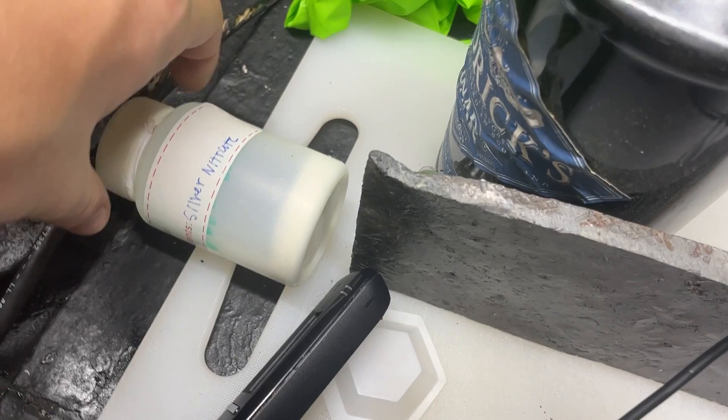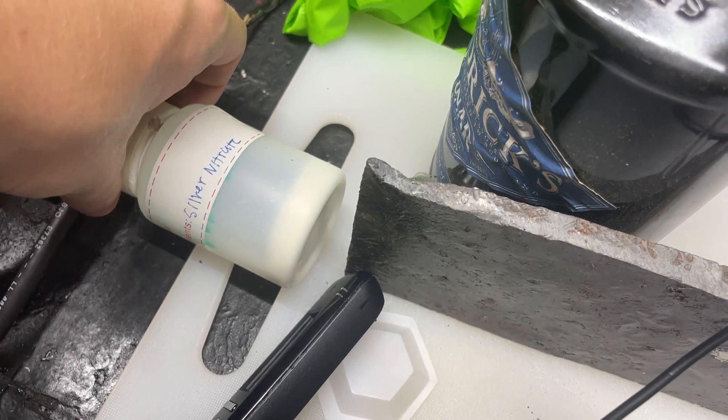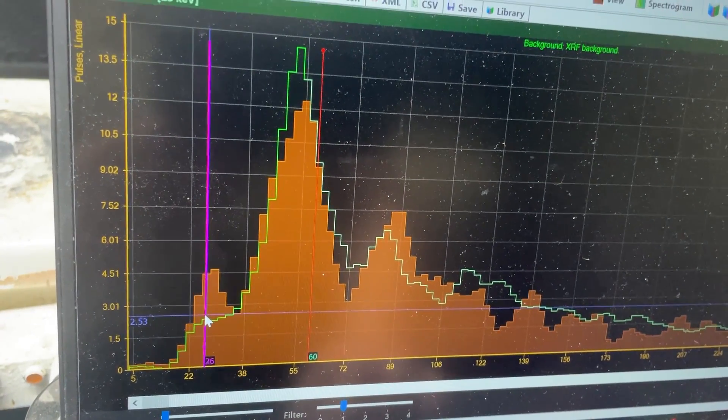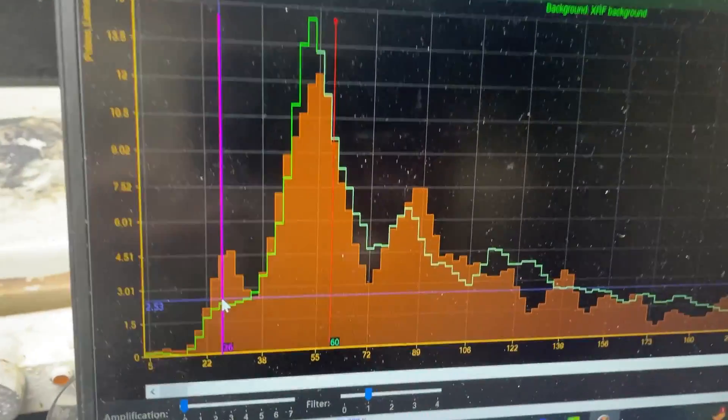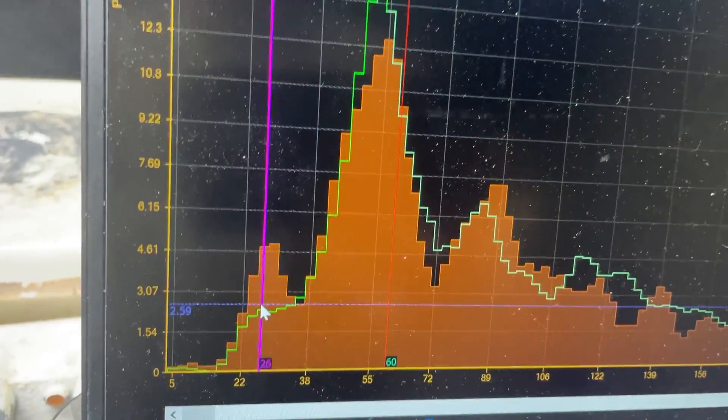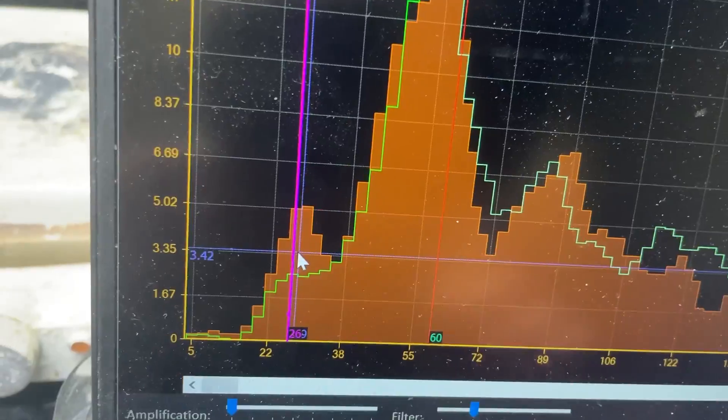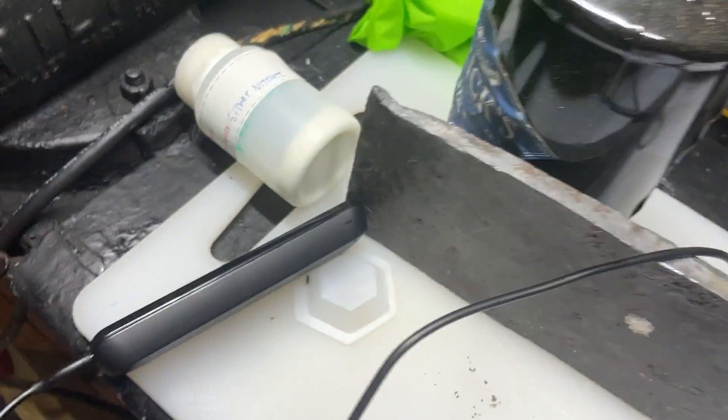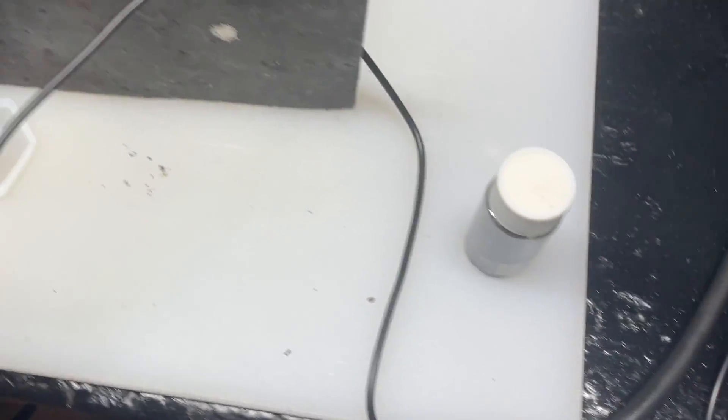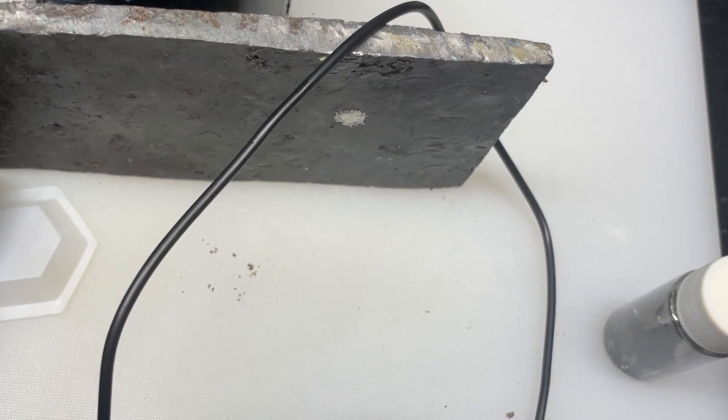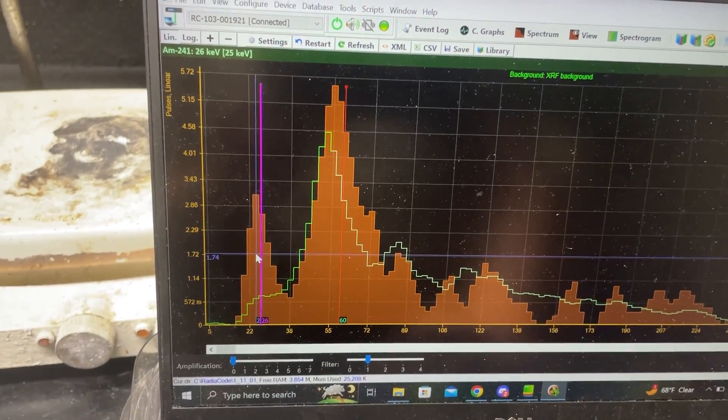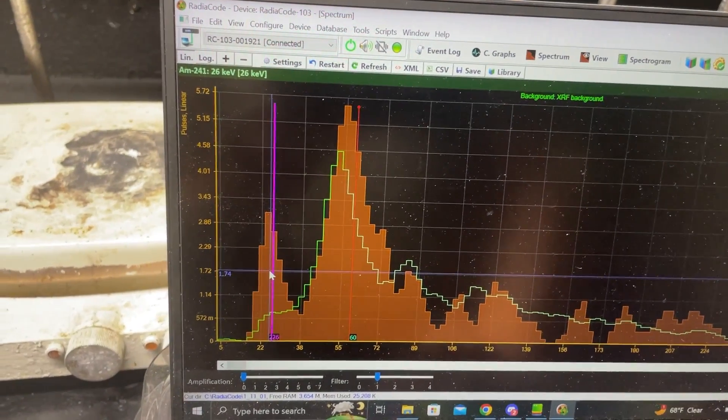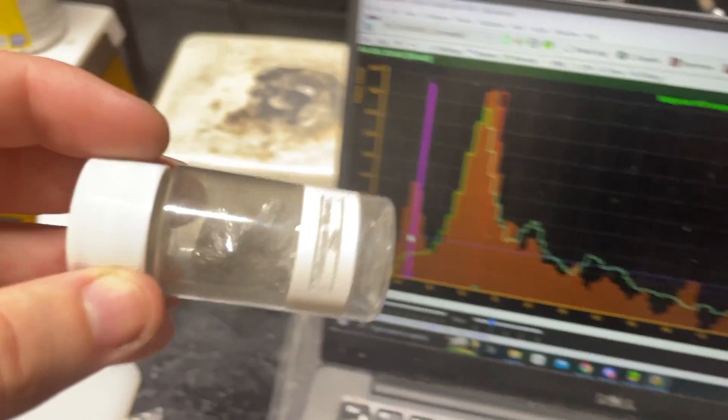Let's see if we can detect the silver in silver nitrate. What was great to say it goes through plastic. That is the cool part. Yeah that's a nice silver peak right there. Oh yeah it's clear as day detecting the silver. That is awesome. So there is silver in our silver nitrate. Sorry I gotta do a little bit more. Let's do some cadmium here. Man look at that clean cadmium peak. Clearly cadmium.